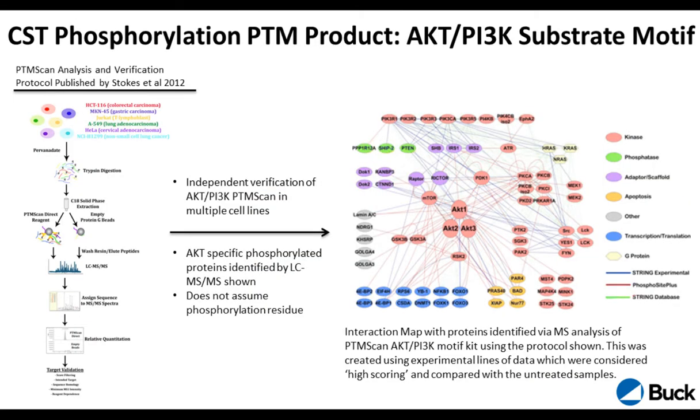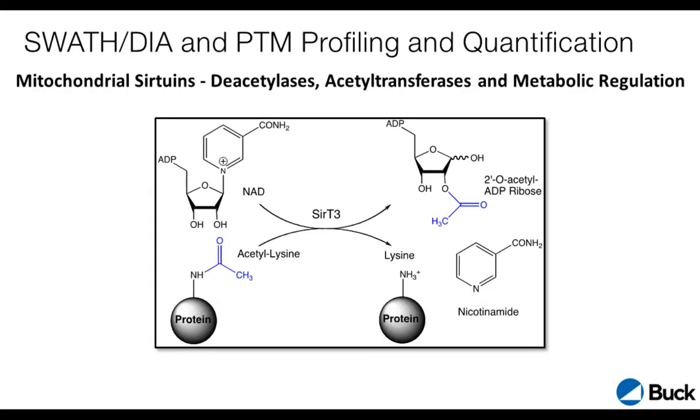And actually Matt had shown you there's a suite of phosphorylation antibodies also available. Actually here, a paper from Matt. But I wanted to show you some of our own work that we have done over the years, and particularly looking at acetylation here. So I mentioned to you there are ways how to add on an acyl group and also to take it off.